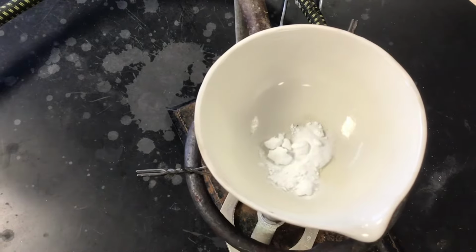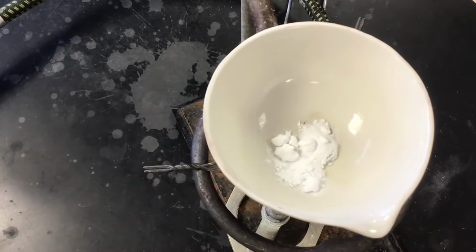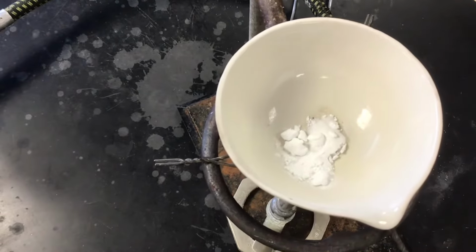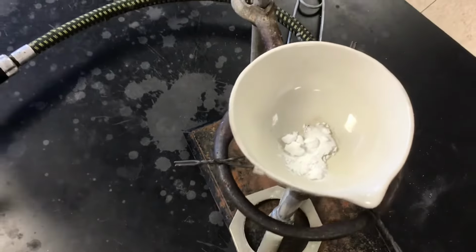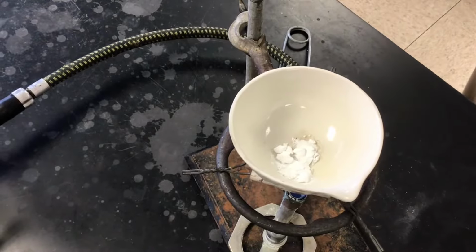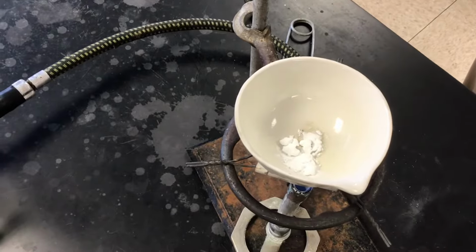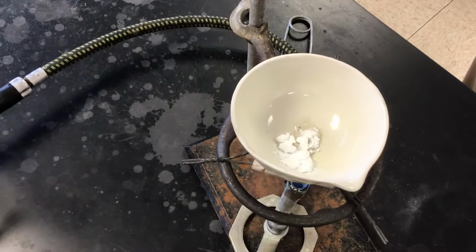Yep, it's starting. Kind of see there at the edges. Yep. There it goes. So it's going to melt, and it really almost looks like water, but then it's going to start bubbling quite a bit, and all that bubbling is the oxygen that's being driven out.